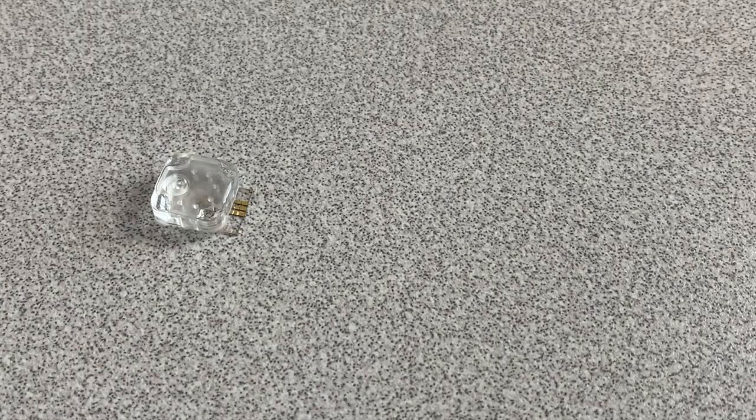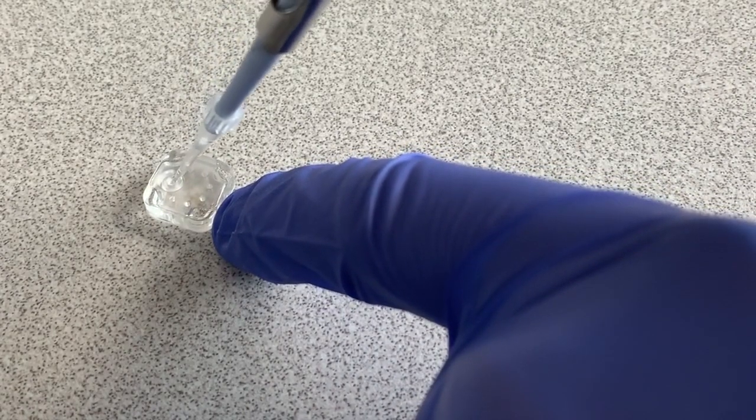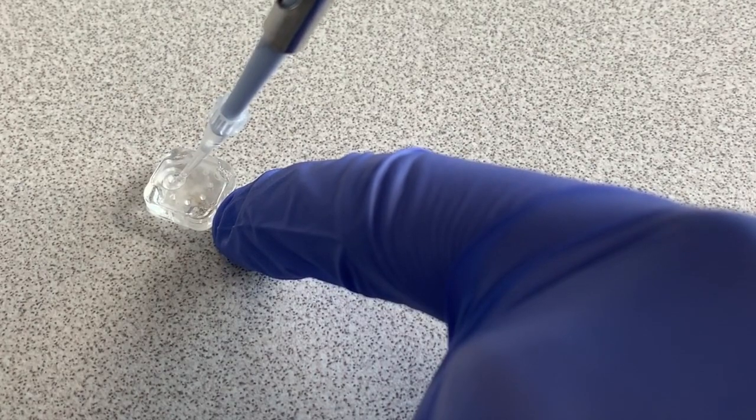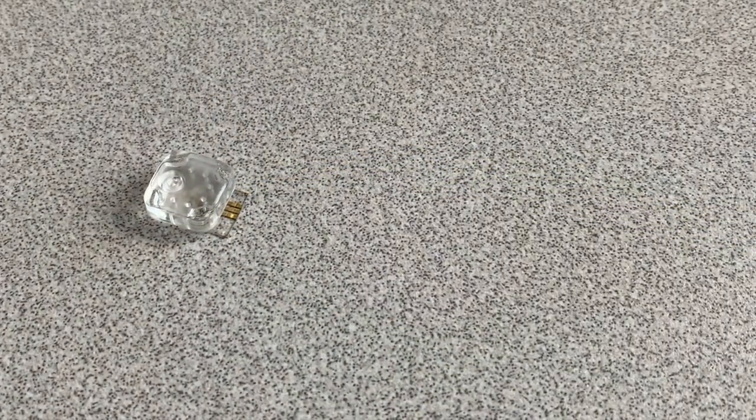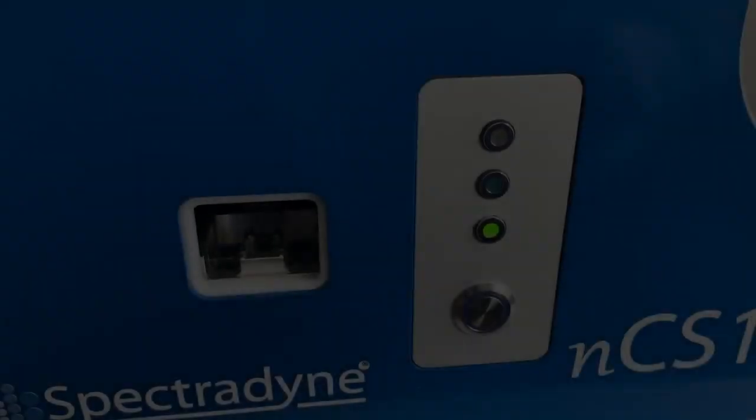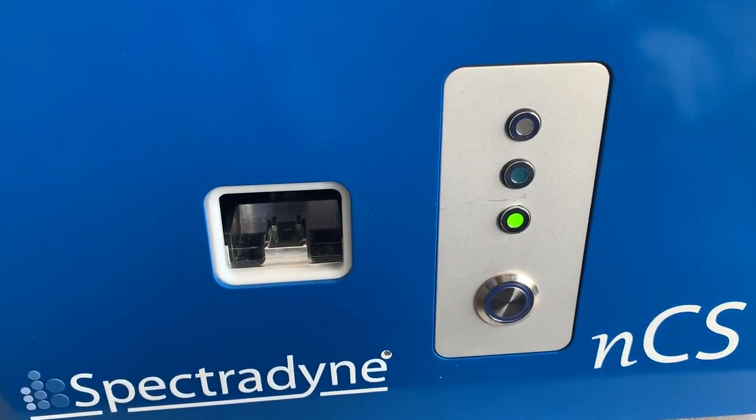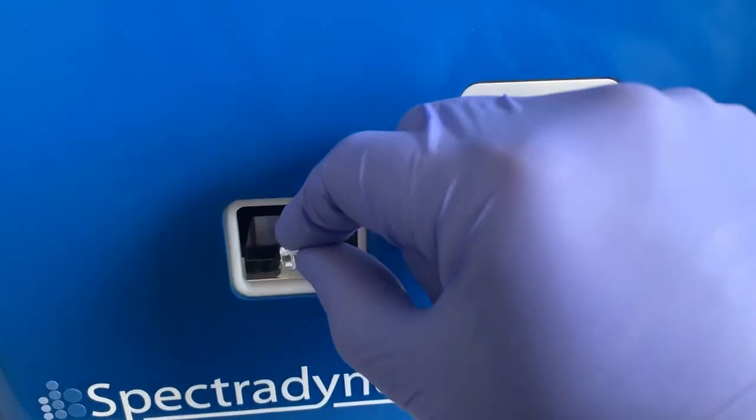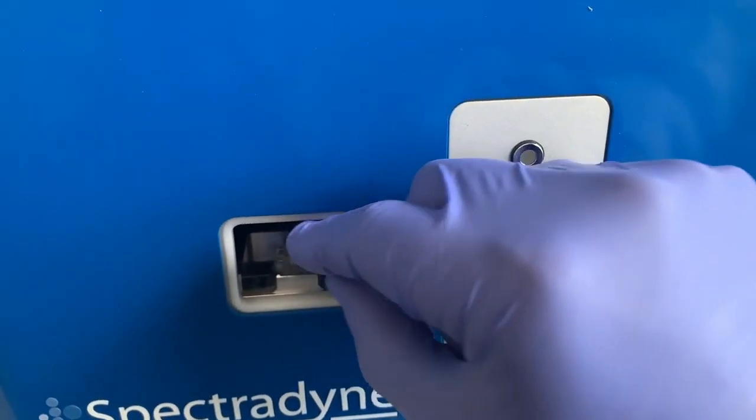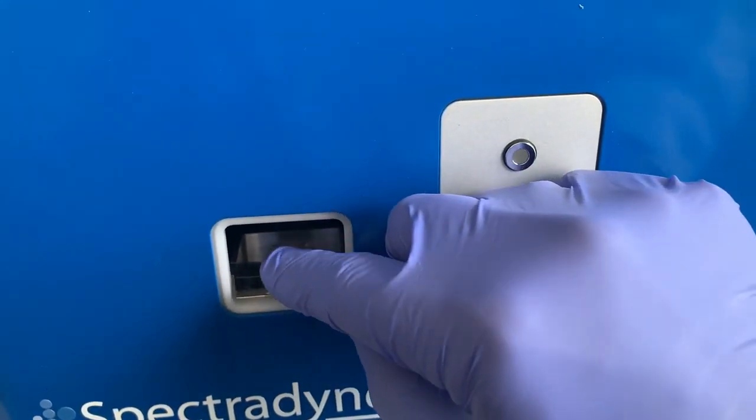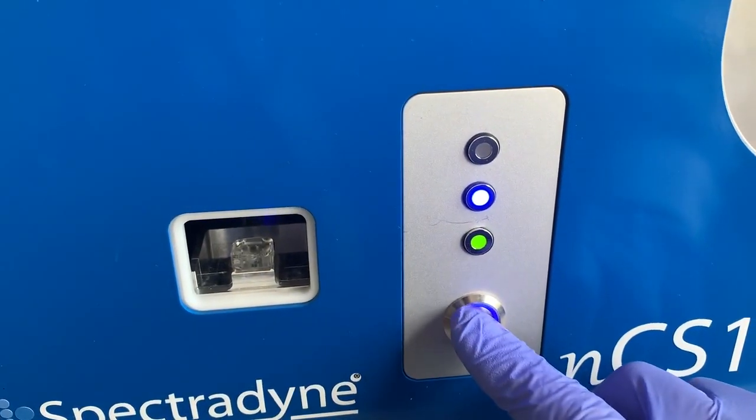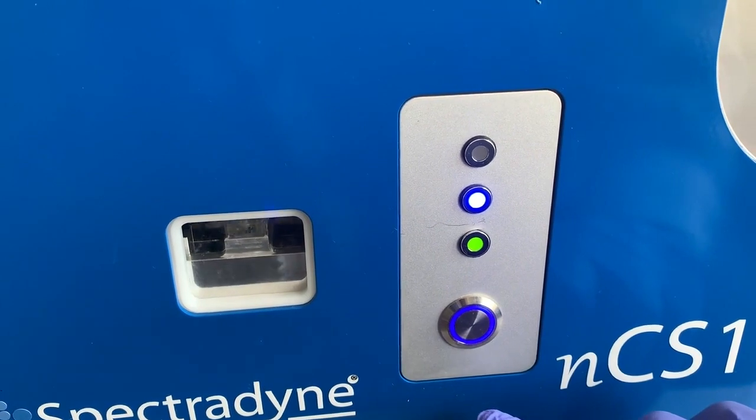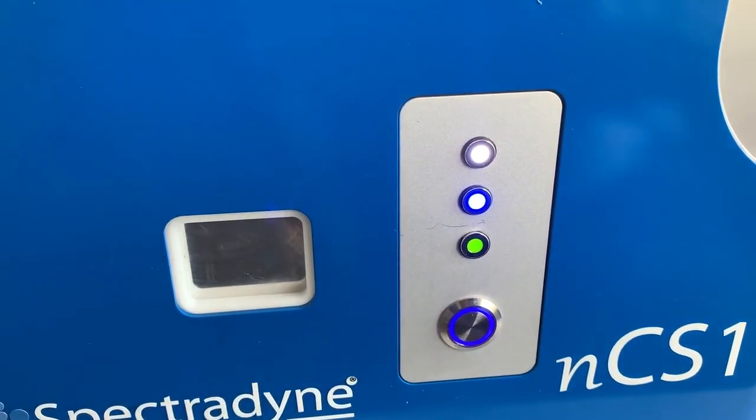So let's start by showing how to fill the cartridge. Merely take three microliters of sample in a pipette, place the pipette tip into the sample port as shown here, pipette out the sample, and you're ready to run the instrument. We just take the cartridge we just loaded, put it into the front of the instrument, slide it in, the blue light comes on to let me know I've inserted it correctly, and we hit the button.